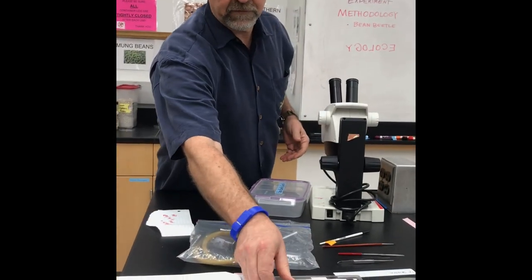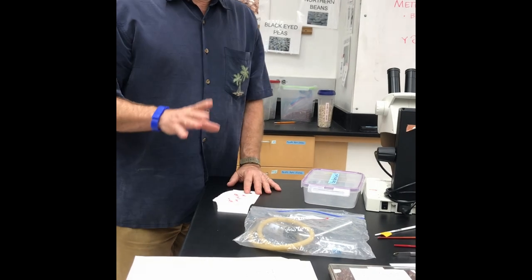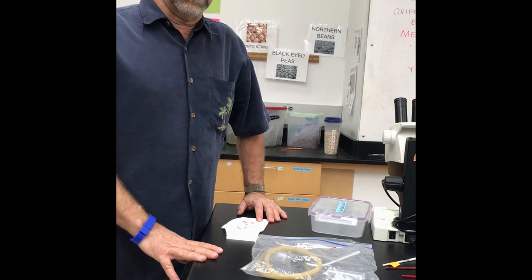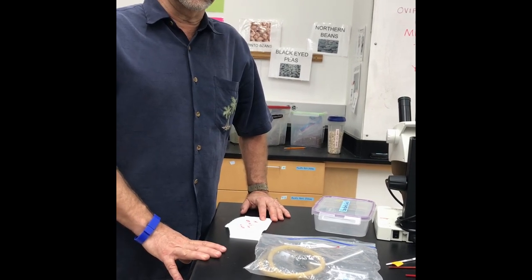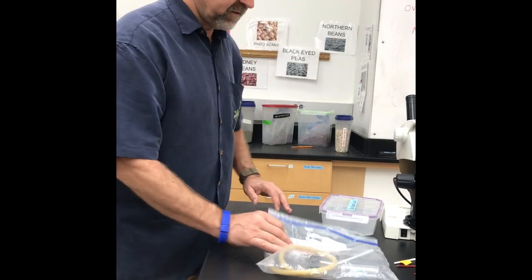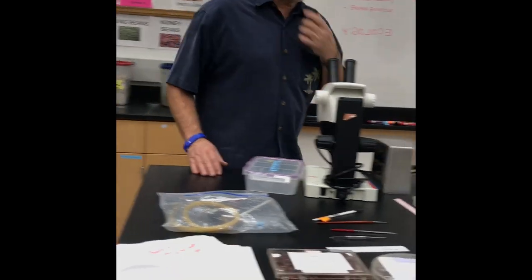Before the experiment, those beans were incubated in our incubators in the back and ready for you to choose which ones you're going to use for your experiment. So how do we get them into our experiments?